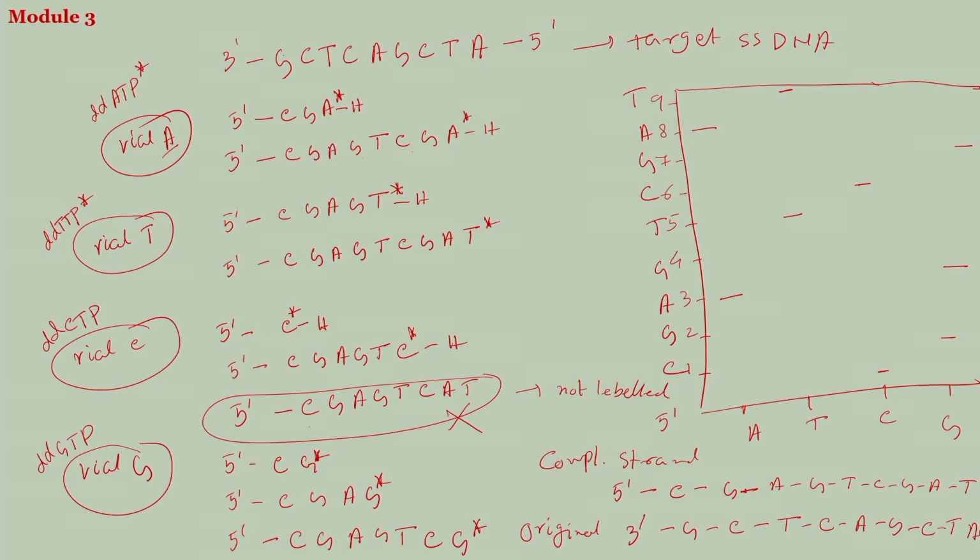So, now let us move on to the other sequencing method, that is the Maxam Gilbert DNA sequencing method.